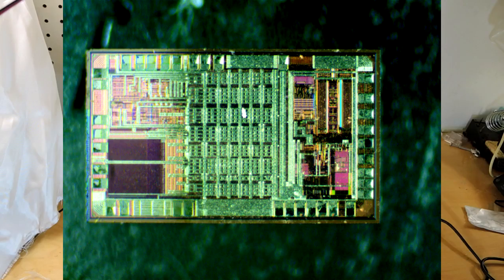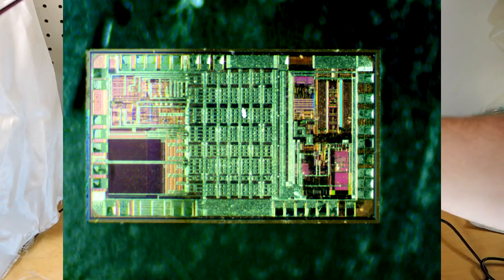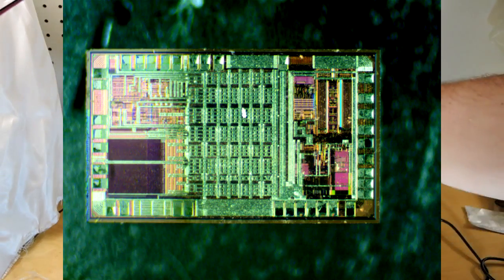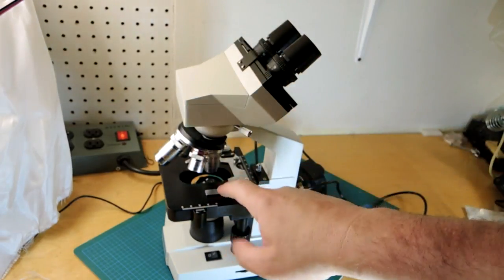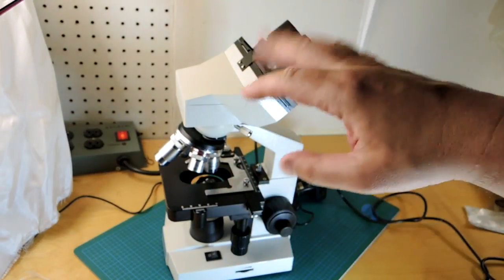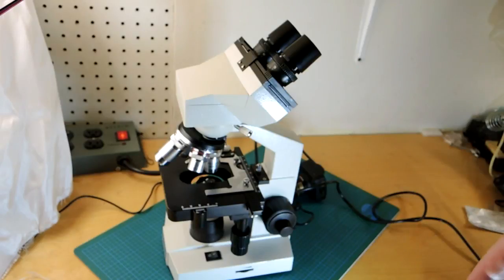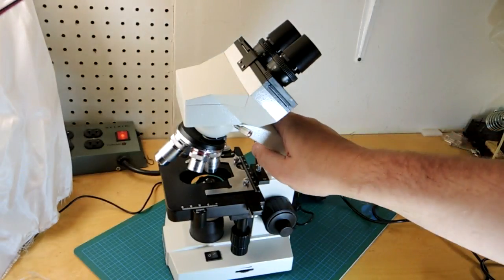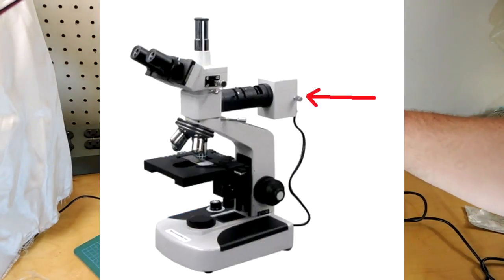I'm interested in micro photographs of silicon dies and such, and where this microscope doesn't do well is with that because the light source is on the bottom. I basically need a top illuminated microscope. They're also known as metallurgical microscopes. Unfortunately they're quite a bit more expensive.